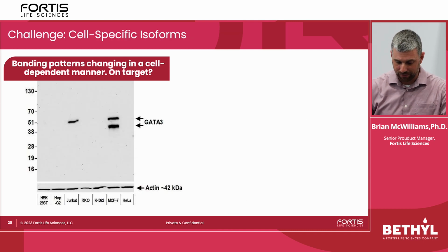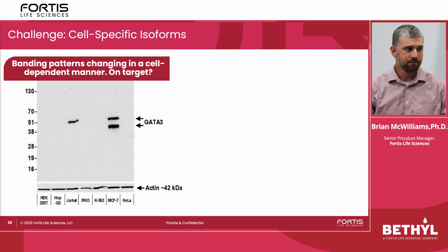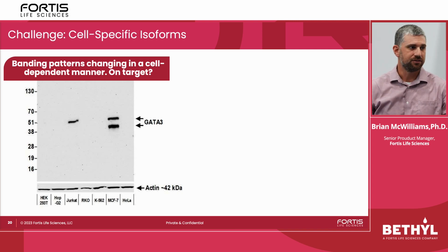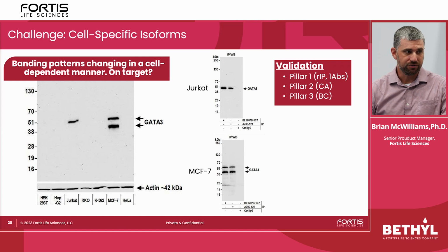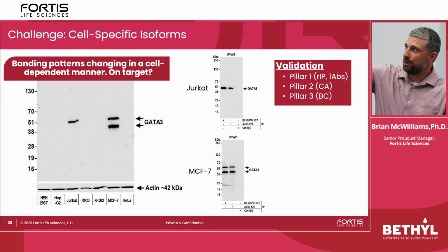And this is also a particularly challenging situation where we have what appears to be a very distinct cell line expression pattern, but we're getting 2 weird banding patterns, okay? So we're seeing a single band here in Jurkat cells and a 2-band pattern here in MCF7s. Well, my first instinct looking at this data is like, well, something's off target here. That can't be right. So instead of just relying on that, we're gonna fall back and do reciprocal IPs now on both of those cell lines with 2 different antibodies against 2 different epitopes of the same target protein, and we're gonna show a distinct banding pattern now in both Jurkat cells and the IP, which matches what we're seeing here, and that 2-band pattern in the MCF7 cells, which is what we're seeing here.